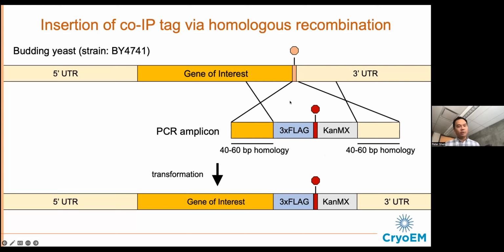But our major bottlenecks have always been at the cryo-EM level, because the inclusion of detergents is just a deal breaker in our hands, especially considering the typical low yields of native complexes. So I admittedly am just not an expert when it comes to membrane protein biochemistry. So I don't have any recommendations for you, Tomas.